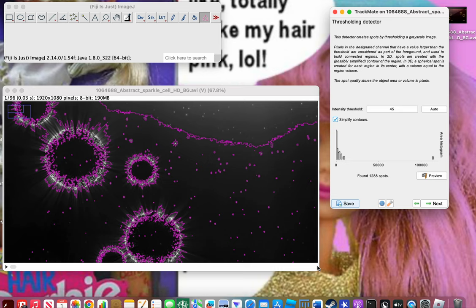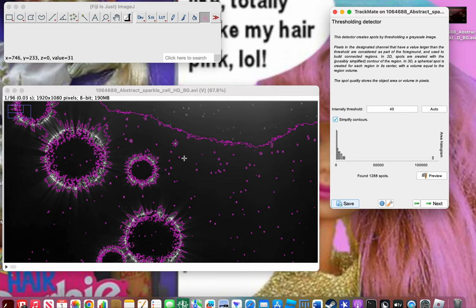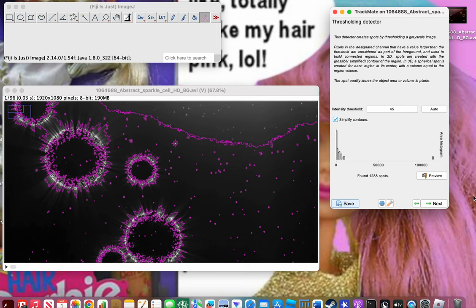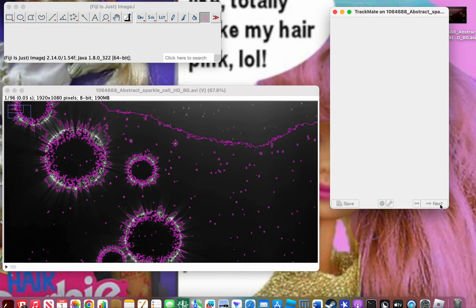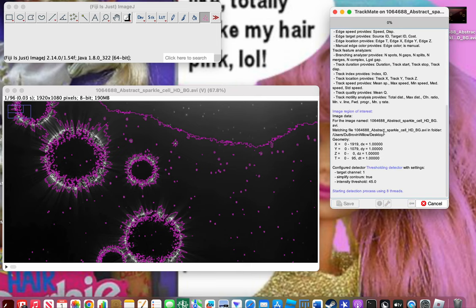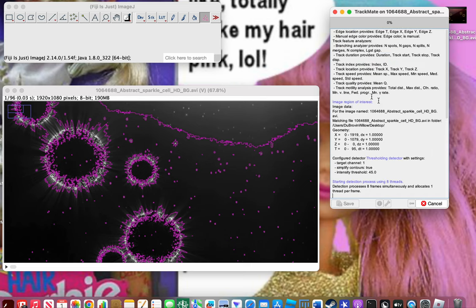You have to make sure you know what it's going to be tracking. If your images are a lot simpler than these massive bright dots, you're going to get a lot simpler lines than this. I thought it looked cool, which is why I didn't use a simpler video. This looks about right, so we're just going to click Next.